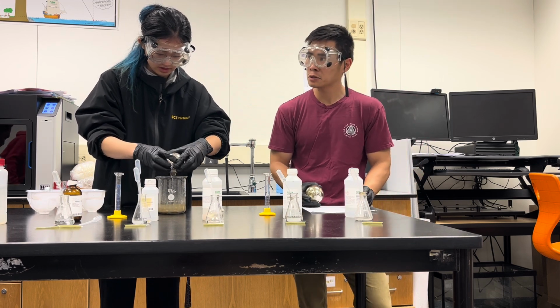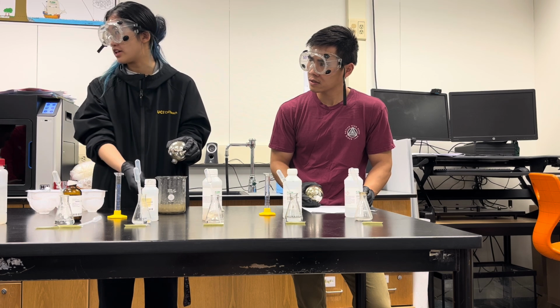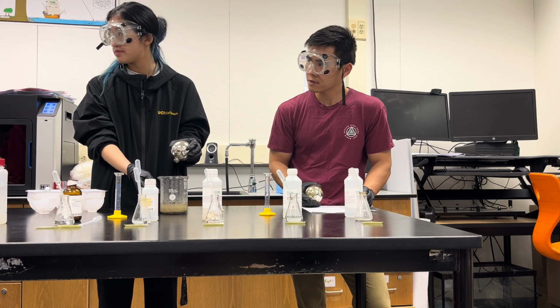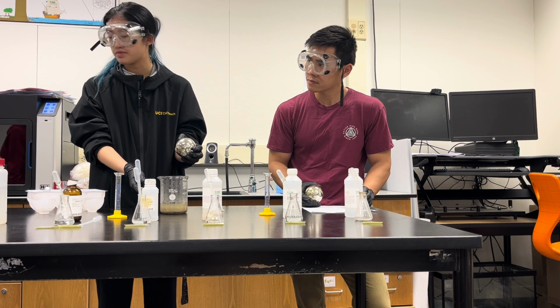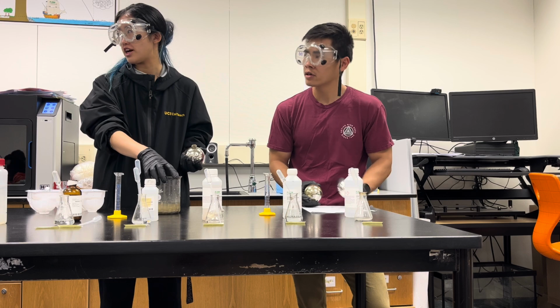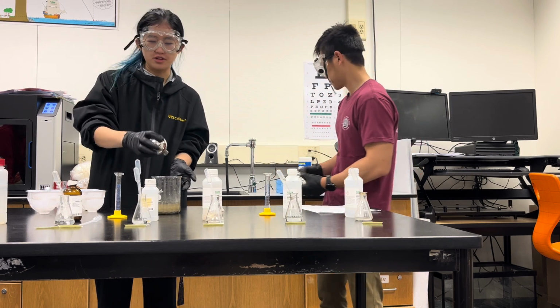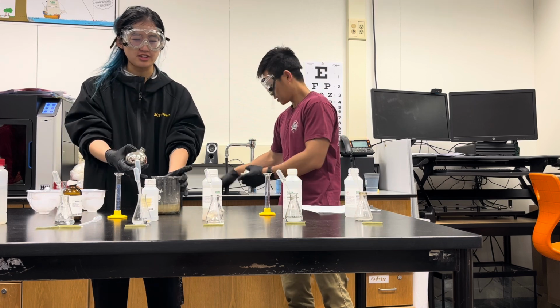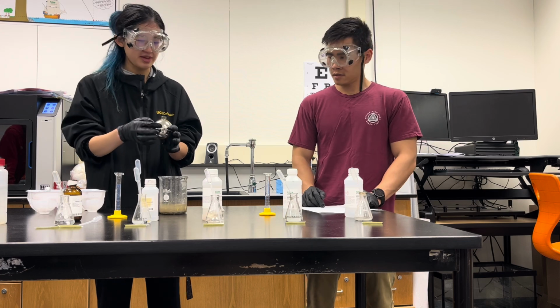Why are we putting the water in there instead of just putting it right into here? Like the water that you're using, you're putting it right into the ornament. Mhm. Can you just put it right into the thing? Oh, this is just for waste. Oh, yeah, everything that we're throwing out. Oh. So now that the water has touched all the chemicals, we don't want to put it back or anywhere. So it goes in the waste so we can dispose of it properly and not contaminate the environment.